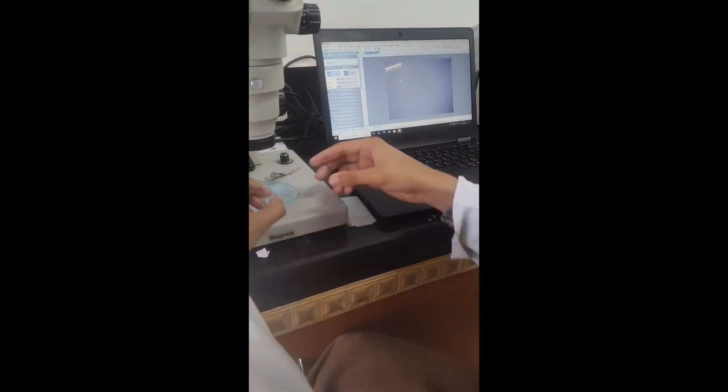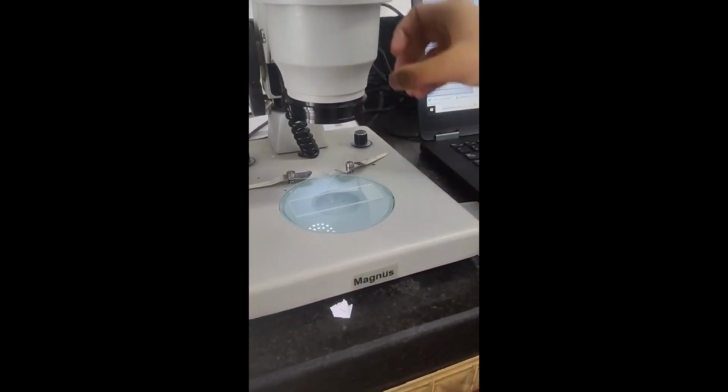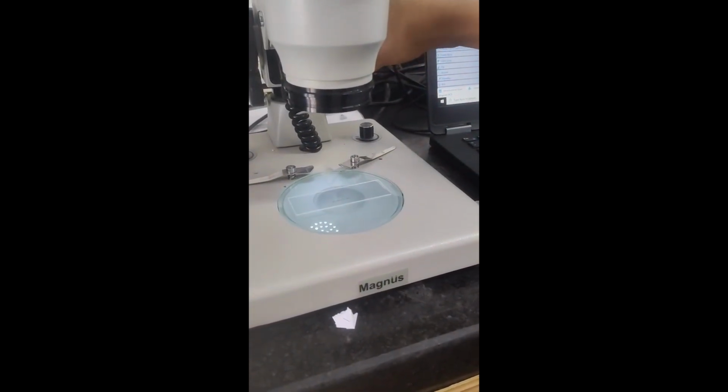Firstly, take micrometer calibration slide and place slide on the stage.